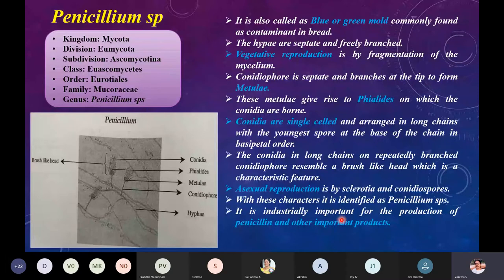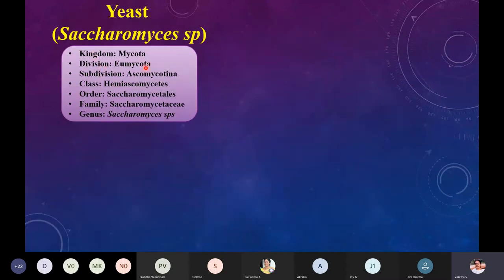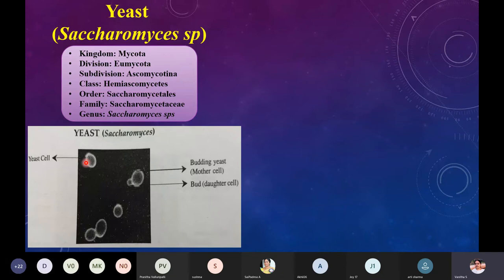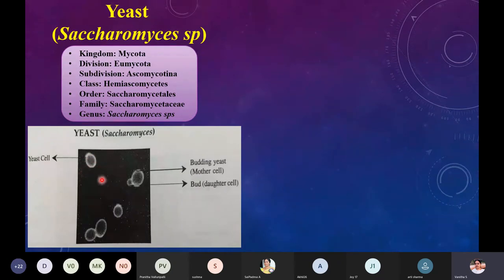Next is Saccharomyces species. Kingdom Mycota, division Eumycota, subdivision Ascomycotina, class Hemiascomycetes, order Saccharomycetales, family Saccharomycetaceae, genus Saccharomyces. In the picture you can see the yeast cells. When seeing yeast and bacteria you may get confused — spherical bacteria versus yeast, which is oval in shape. Yeast cells are oval, with a bulge visible in the center, and you can see budding in these organisms.